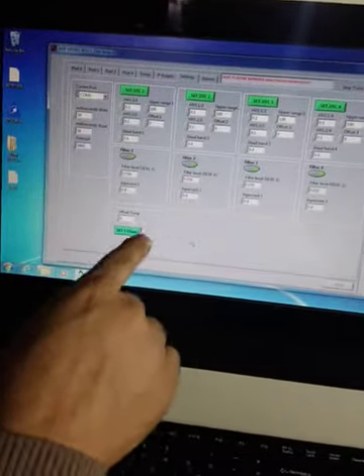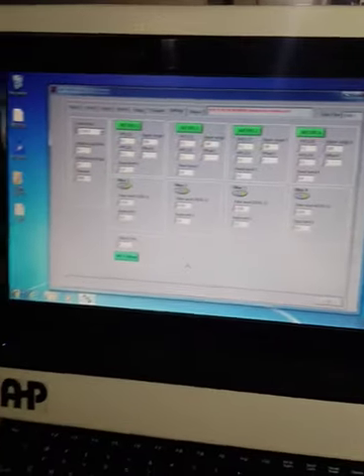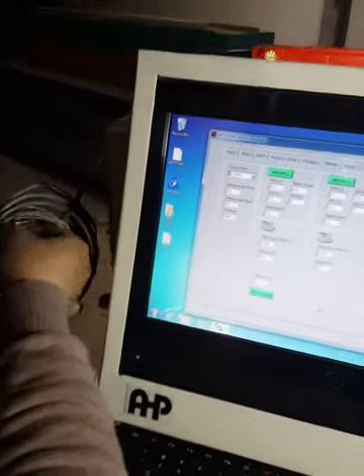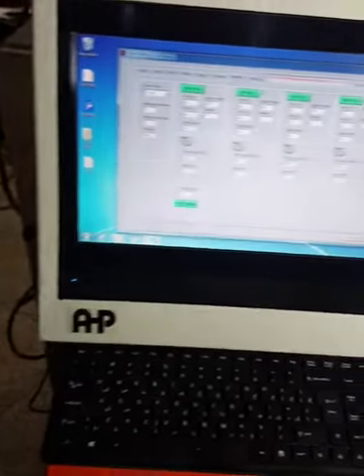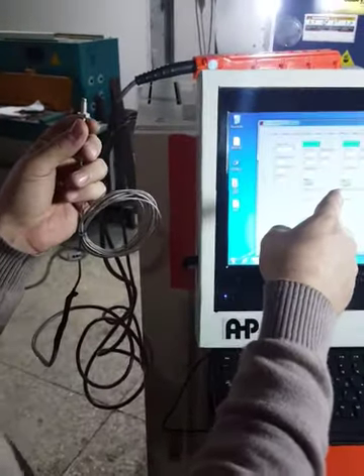The other thing that you can adjust here: whenever you want to use this hydro unit with a specific hot water bath, you will need to connect this thermocouple to the bath. This is a standard K-type thermocouple. It needs to be connected to the water bath for monitoring the temperature of the channel.